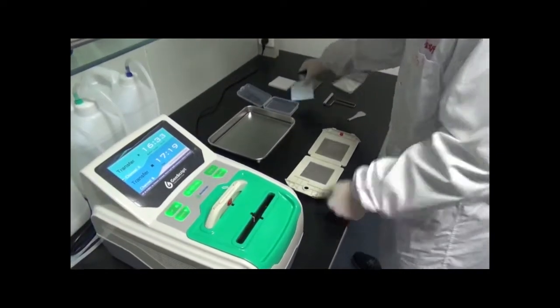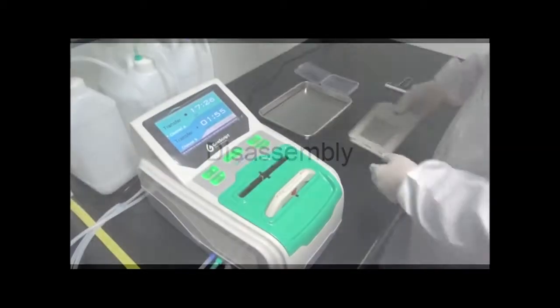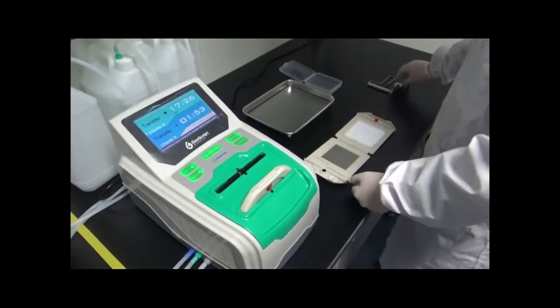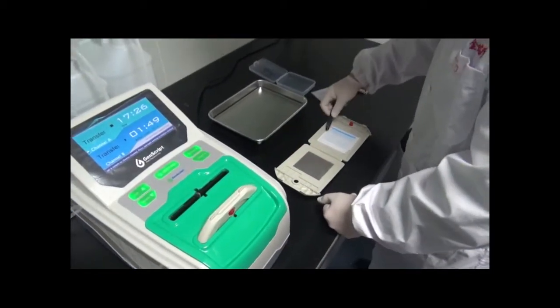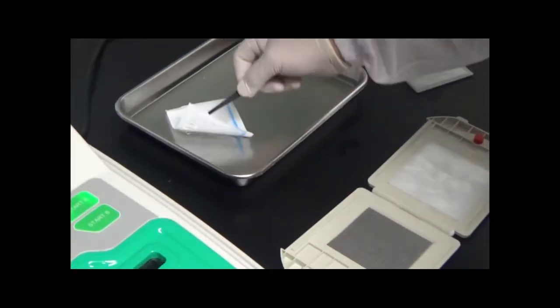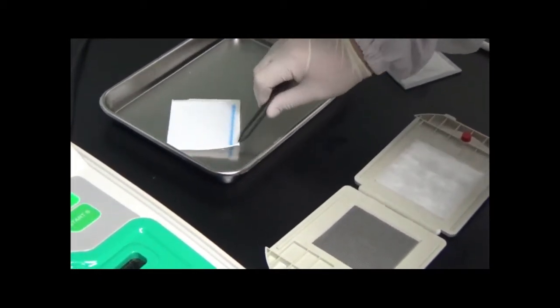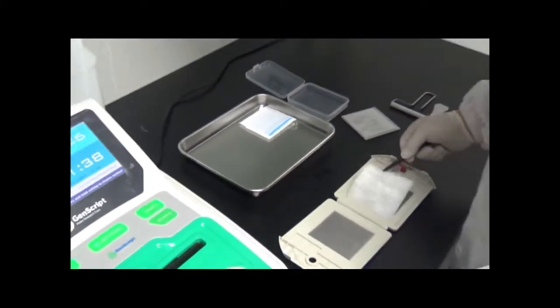After the transfer is complete, push the corresponding button to stop the run and remove the cassette. Lay the cassette flat on the bench top and remove the sponge and gel and discard both. Pick up the membrane with forceps and wash it in a DI water tray.